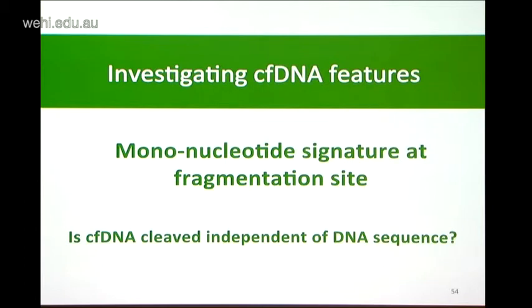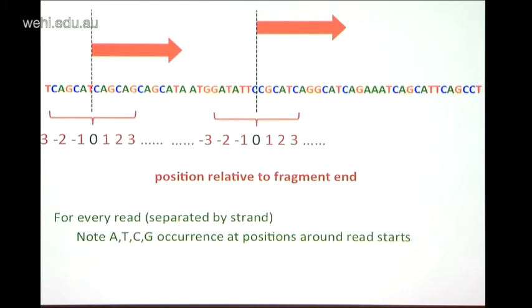So I'm going to switch focus right now to a different feature in cell-free DNA. This is where we actually looked at sequence motifs at the cleavage site. So we wanted to see whether cell-free DNA was cut up at specific sequence motifs, or whether it was independent.